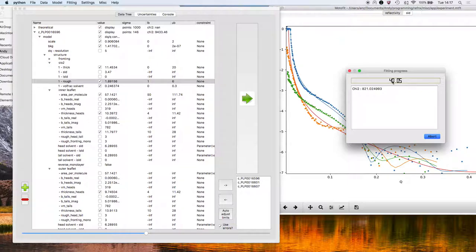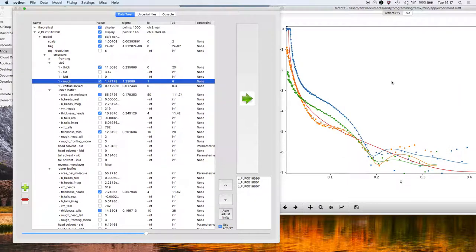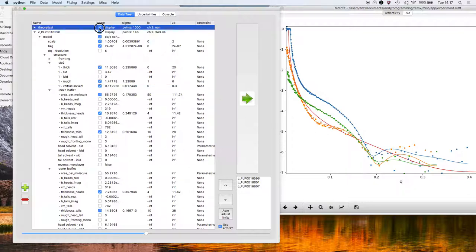By default, the fitting uses differential evolution for the minimization, but you can also choose Levenberg-Marquardt with the least squares, or you can use BFGS, which is also a very quite robust solver. There we go. I'm just going to hide the theoretical dataset. There's the three different datasets co-refined, contrasts co-refined.